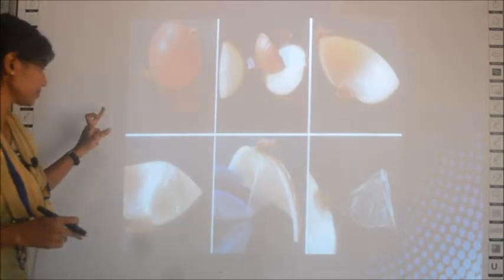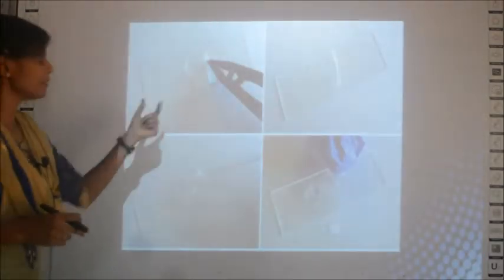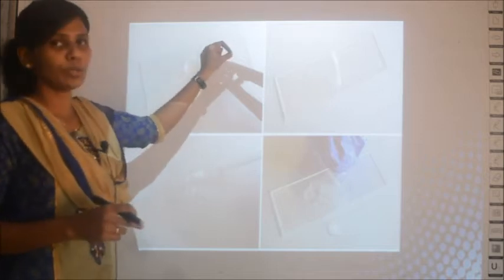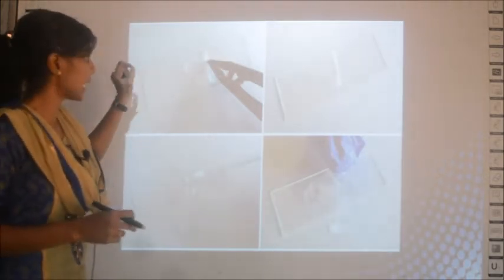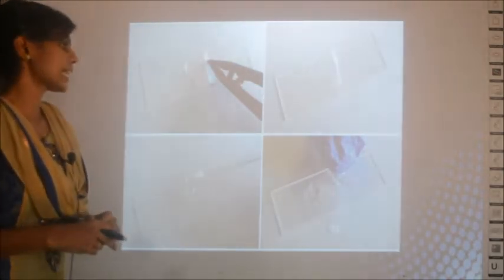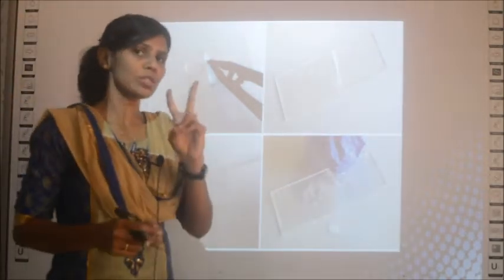Okay. So now you have this epidermal layer. So place it on the glass slide. I told you, you are going to use a glass slide. This is the glass slide. Place this peeled epidermal layer on the glass slide and then you will add 2 solutions.